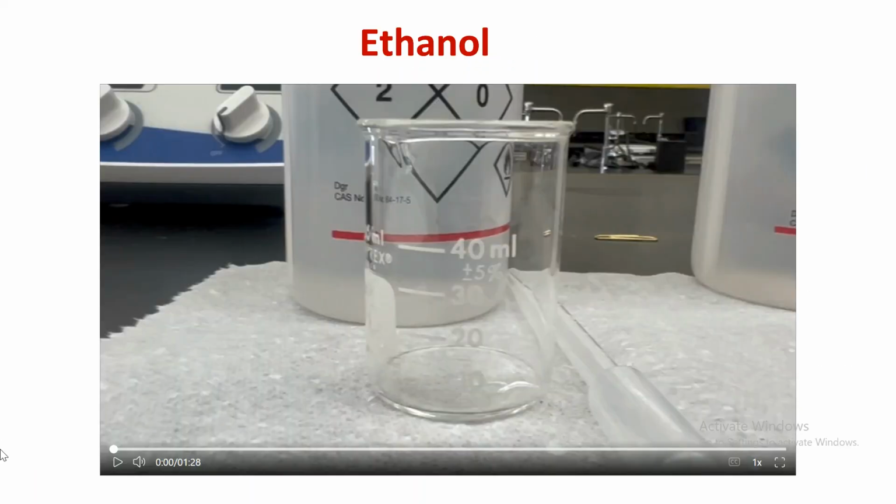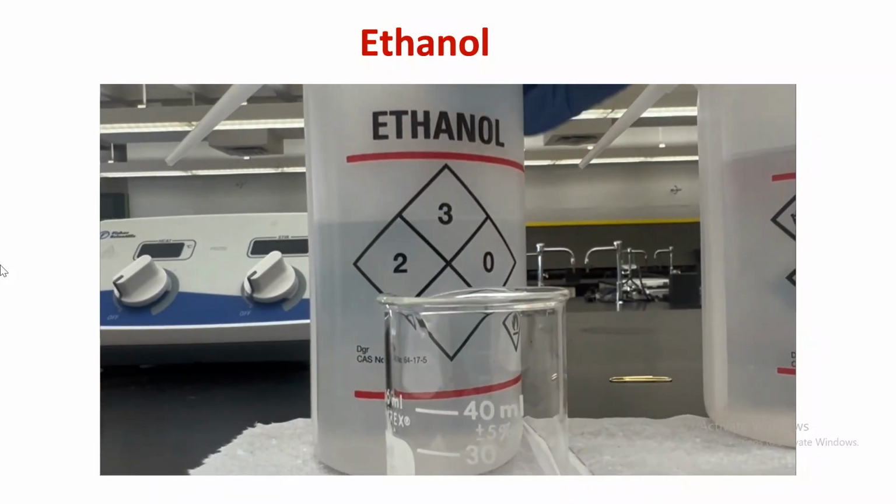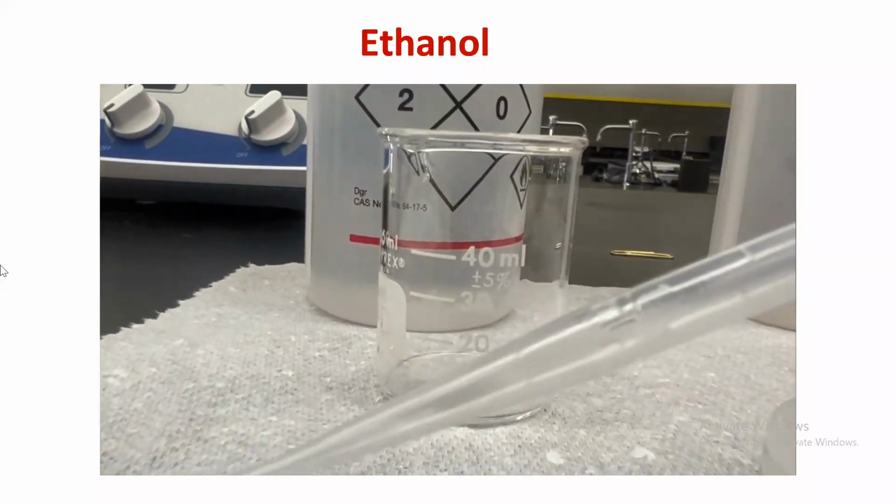All right, so let's start off with ethanol. Ethanol is a form of alcohol.